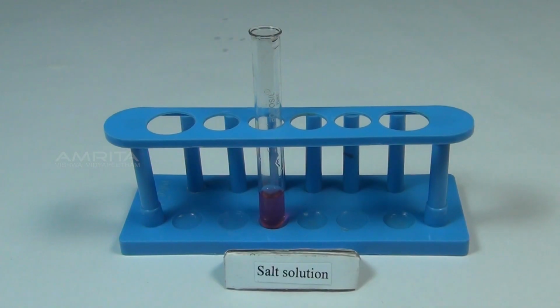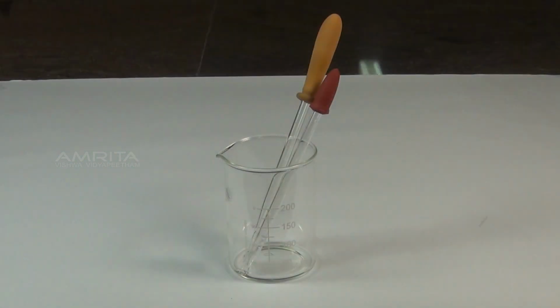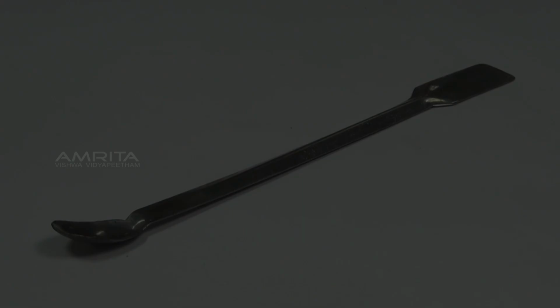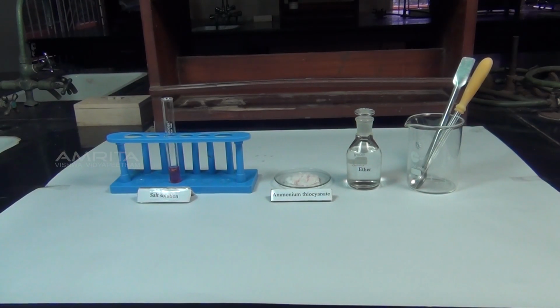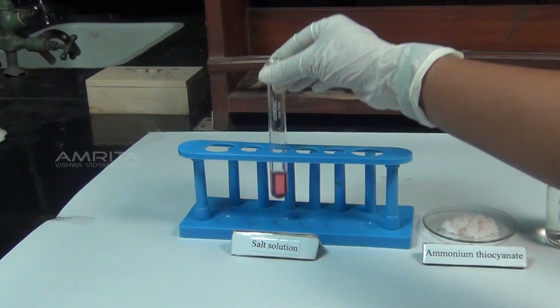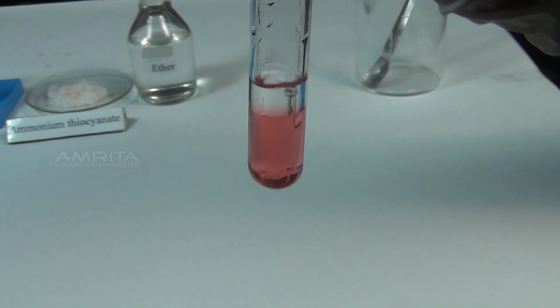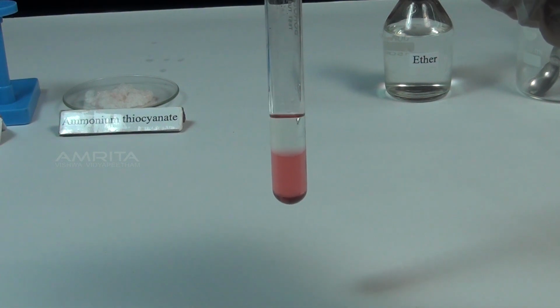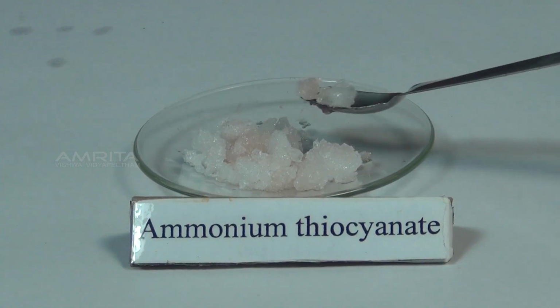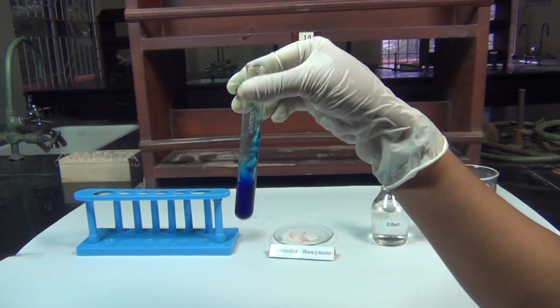Ammonium thiocyanate ether test. Materials required: salt solution in a test tube, ether, ammonium thiocyanate, dropper and spatula. Procedure: take a small quantity of salt solution in a test tube. Using the dropper, add a small quantity of ether to the solution. Ether forms a separate layer above the salt solution. Add a few crystals of ammonium thiocyanate to the solution. Shake the test tube well.